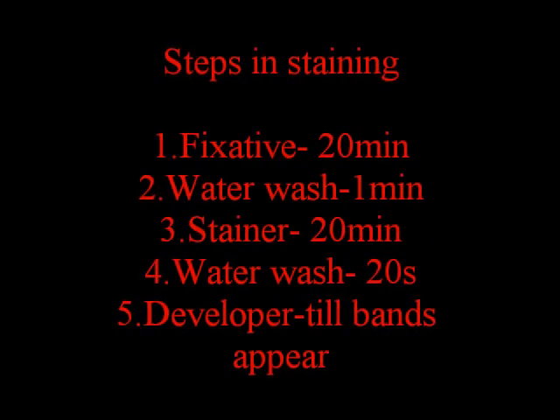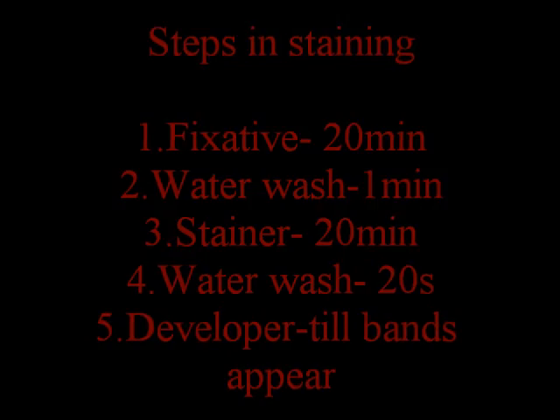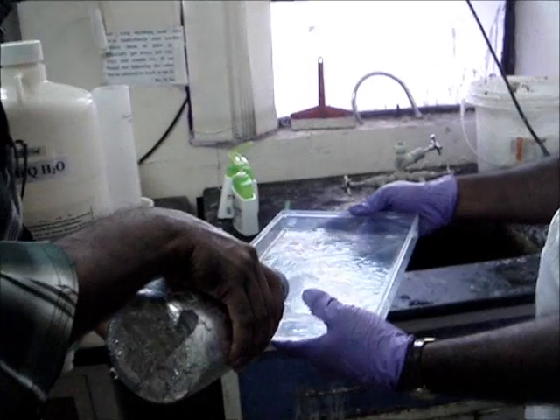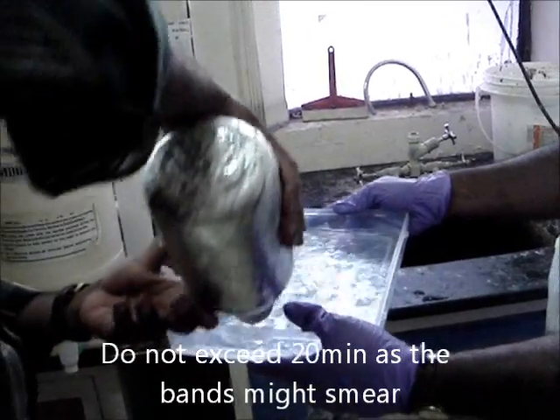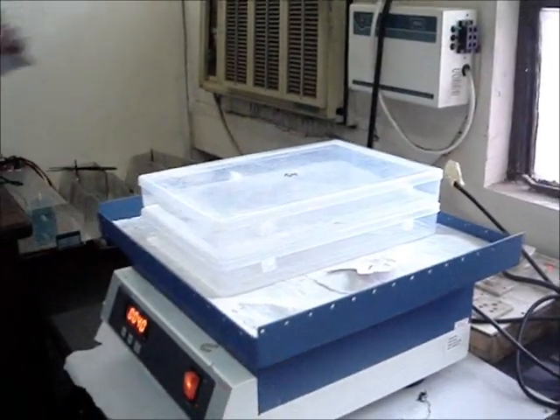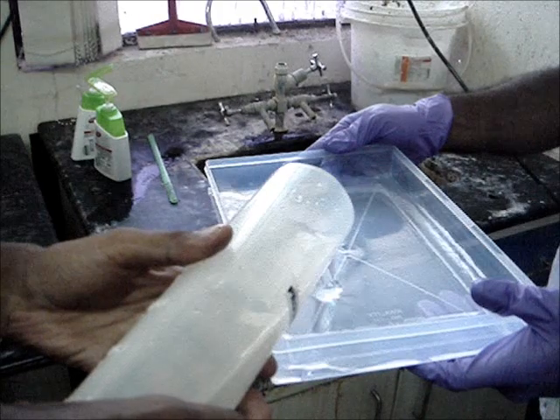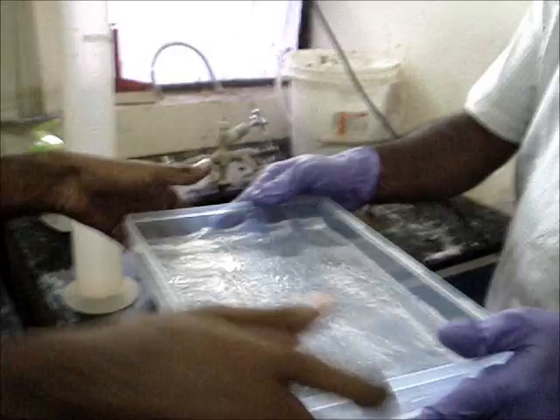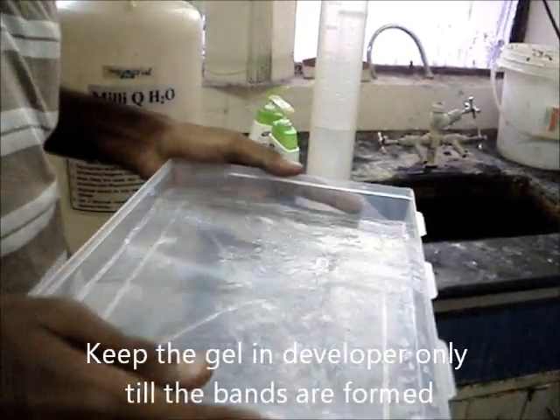After 12 hours, carefully remove the gel. Step 5: Staining the gel. Steps involved in staining: rinse the gel in water, then add silver nitrate solution to the gel. Place it on a shaker and cover it. Rinse the gel in water, then rinse in the developer solution until the bands are formed.